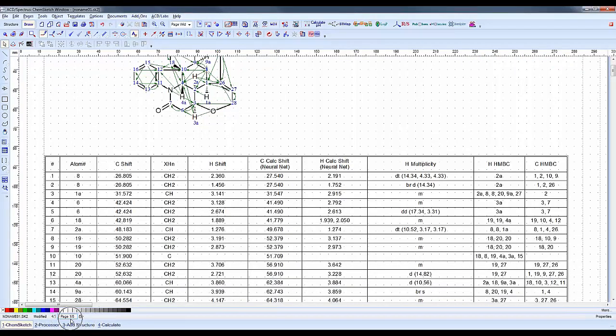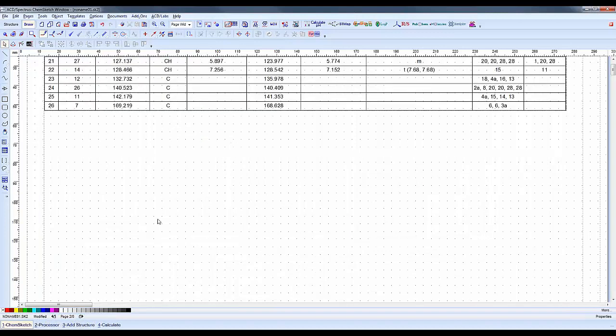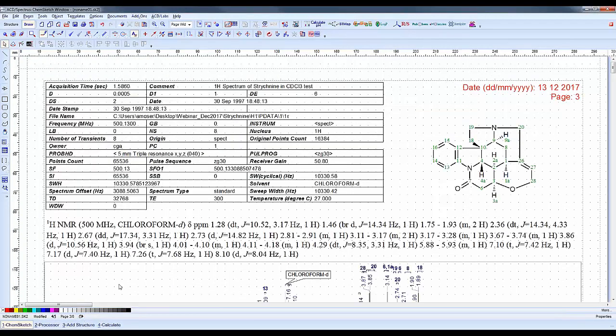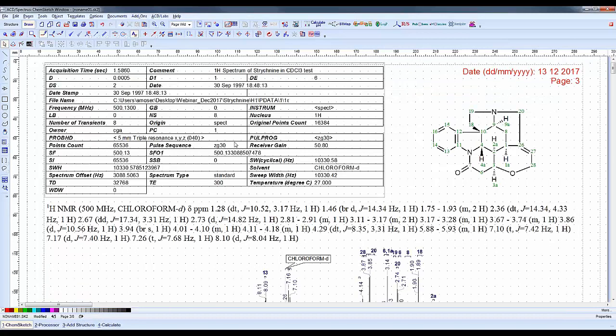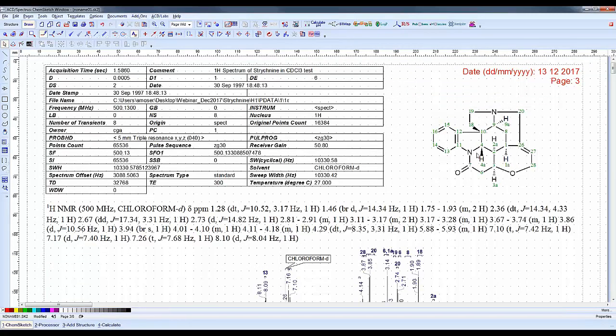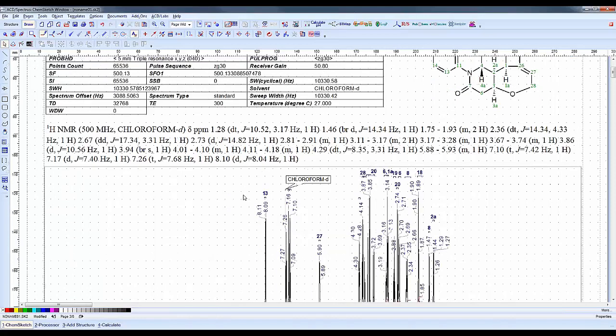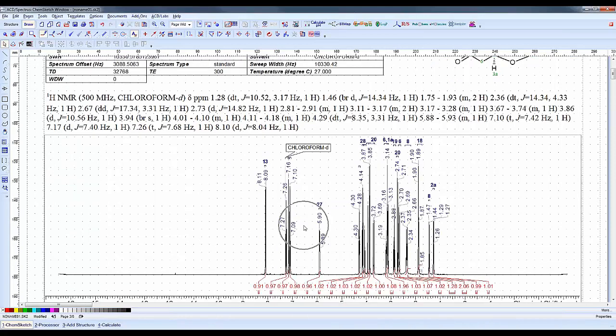We have more than one page here - page 1 of 8. We can flip through the different pages. We have the extension of the table here, and our proton NMR. Here we have our metadata, structure, and multiplets done in journal format.